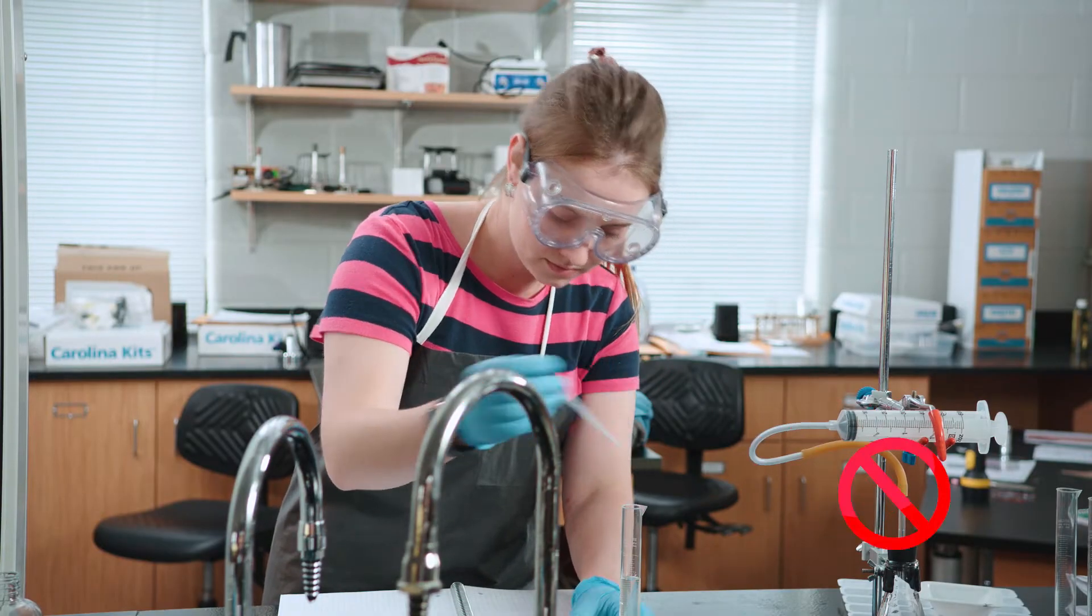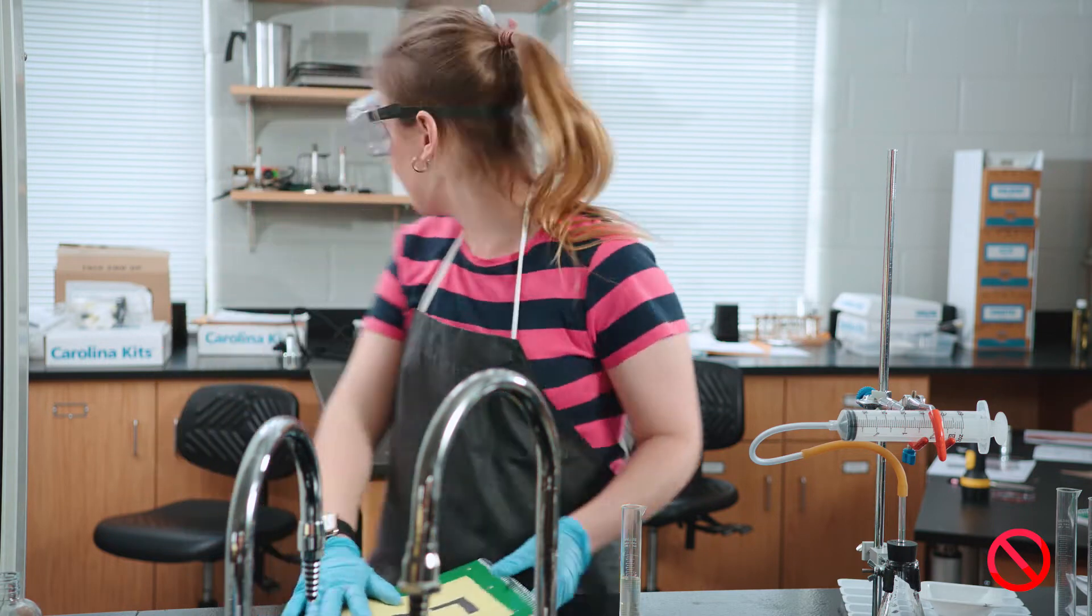Do not remove chemicals, specimens, equipment, or other supplies from the lab.